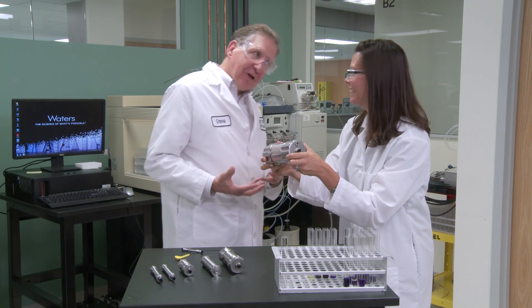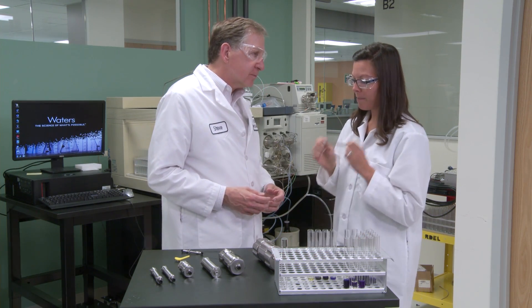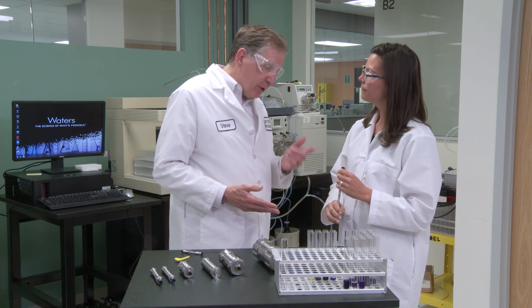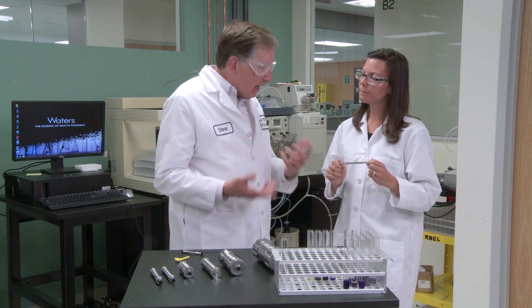Now wait a minute — don't start right there. You need to figure out what your goals are. Well, really I think my goal is to take my analytical method and match it exactly to the prep method. I mean, you need to actually go with exactly the same chemistry in both your analytical and your preparative column. It's kind of a pairing.